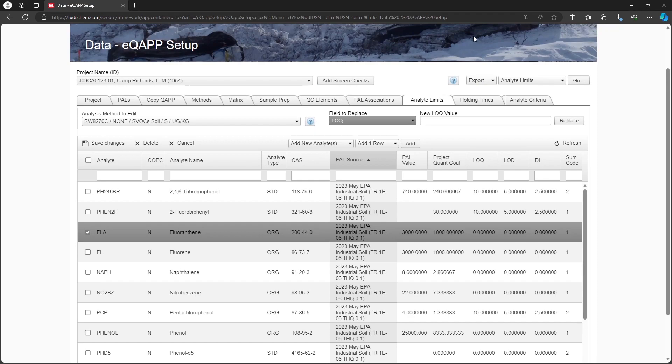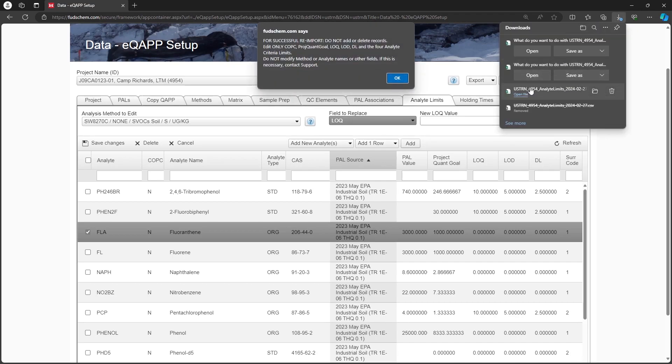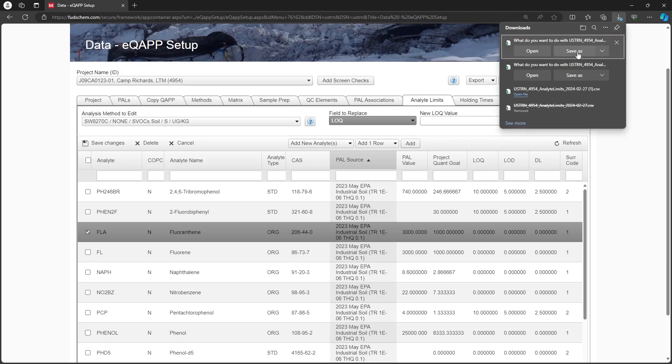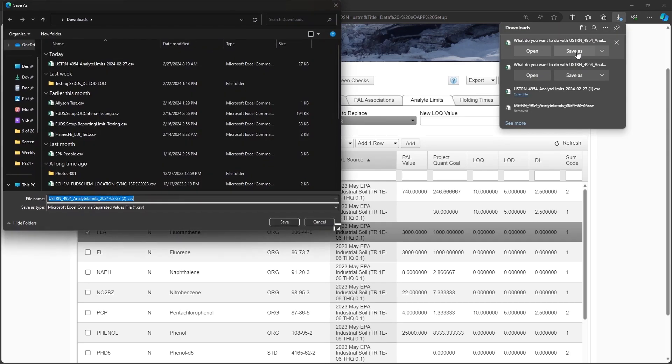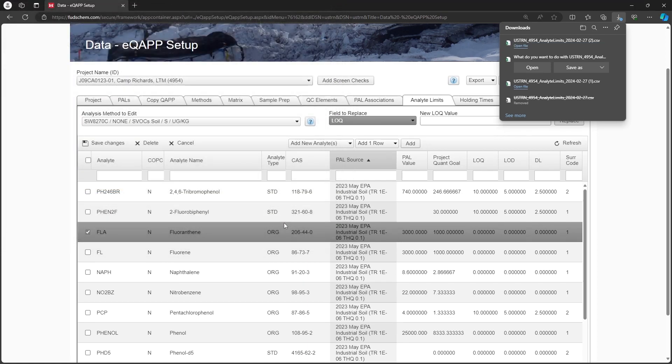In the upper right, set the drop-downs to Export, Analyte Limits, then click Go. The system will display a warning that you can only edit certain fields in the spreadsheet. Be careful not to add or remove any Analytes from the spreadsheet. Similarly, be careful not to add or remove Analytes from the EQAP before you have had a chance to reimport this file.